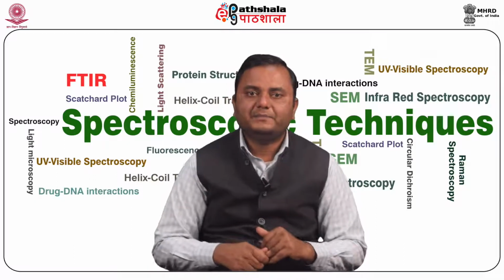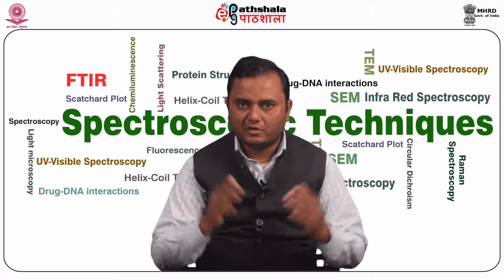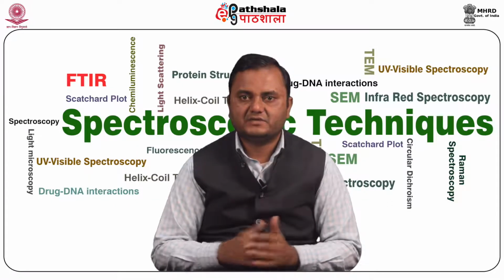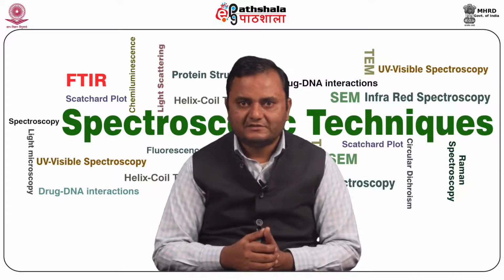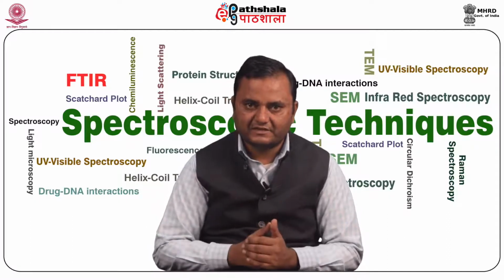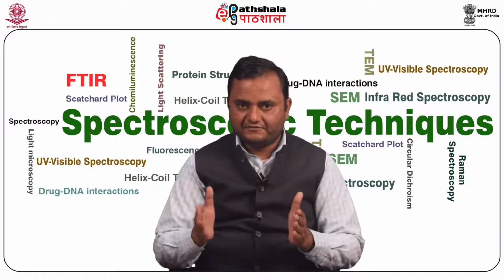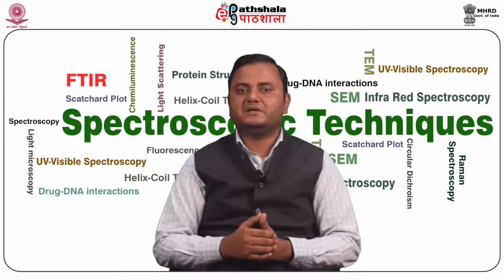Then the sample beam enters the sample compartment, where it is transmitted through or reflected off the surface of the sample. Then the beam finally passes to the detector for a final measurement, and of course you need a computer which measures the signal, digitizes it, and sends it to the computer where the Fourier transformation takes place. The moving and fixed mirror in the interferometer is the only moving part of the instrument.